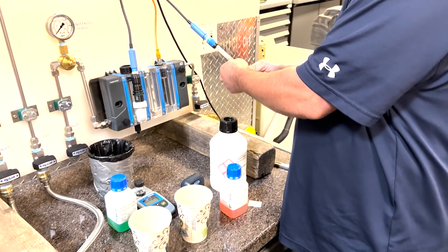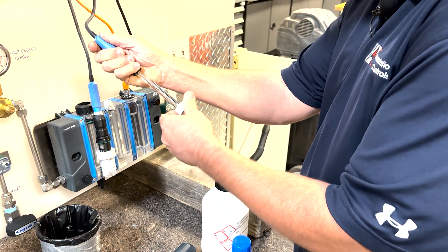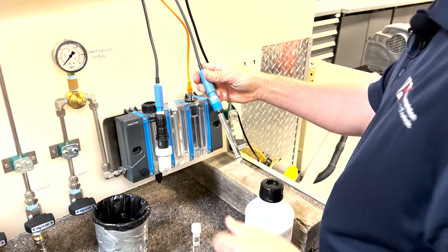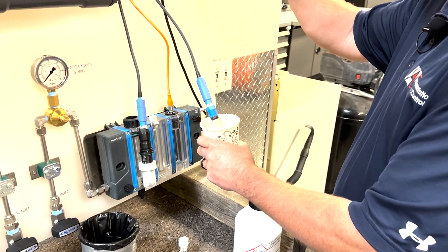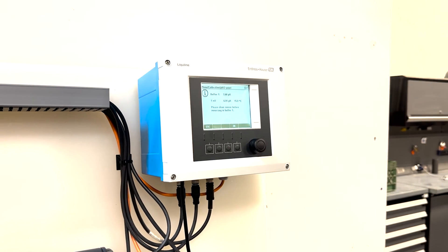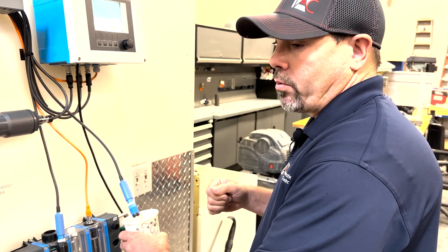We're going to remove the sensor from the wetted housing. You want to be careful when removing these — they are glass sensors with a little O-ring. We're going to immerse it in the 7 solution, which is the green solution. If you had a sensor you were taking out of the process, you would want to clean it with some distilled water before putting it in the buffer so you don't contaminate your solution. This is a brand new sensor, but if you were taking it out of your process, you'd want to rinse it with distilled water.